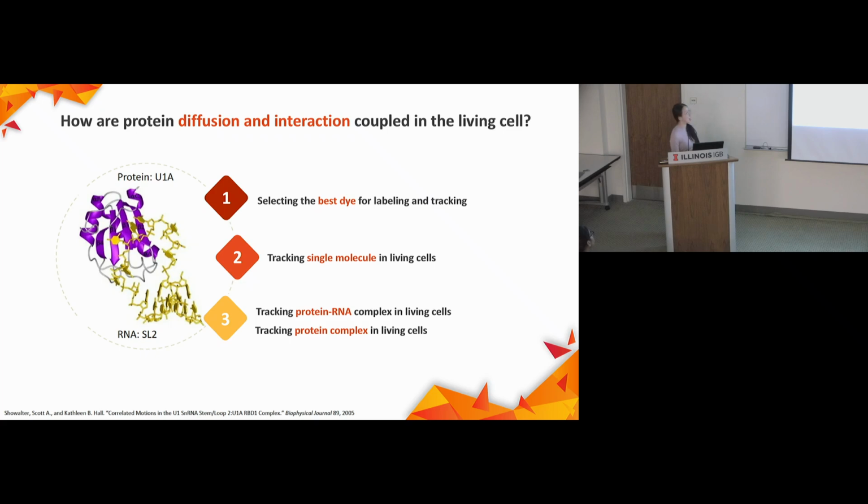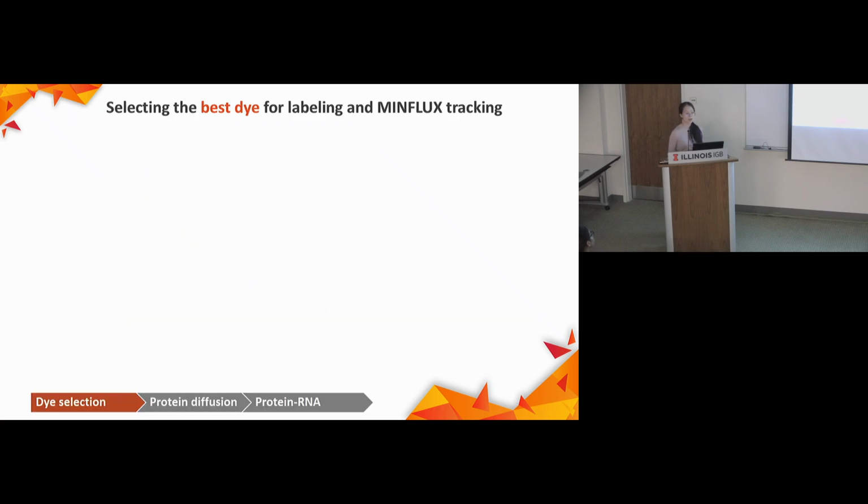It can be this model system, protein RNA complex, or it can be another model system that we'll discuss later. It's a protein-protein complex. Okay, so let's do this one by one. First, selecting the best dye for labeling and MINFLUX live cell tracking.